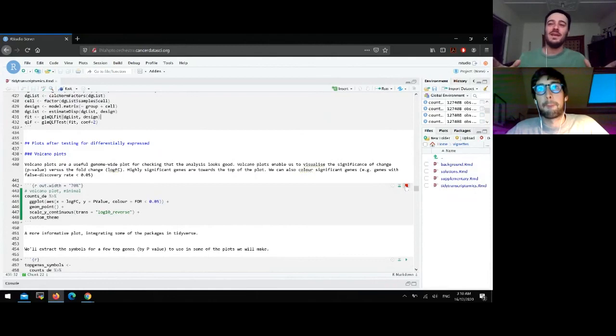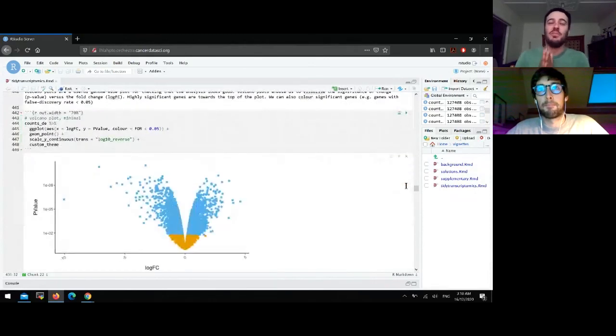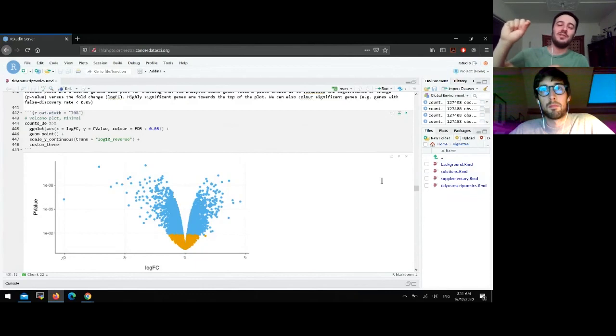Again, many functions ad hoc produce volcano plots, but here I show you the case where we might want to customize the plot for publication-ready visualizations or data integration, and so on and so forth. So usually, when we stay on the cookie-cutter path, it's all good. But once we want to customize things, it's a bit more difficult. We have to extract information and maybe use ggplot.